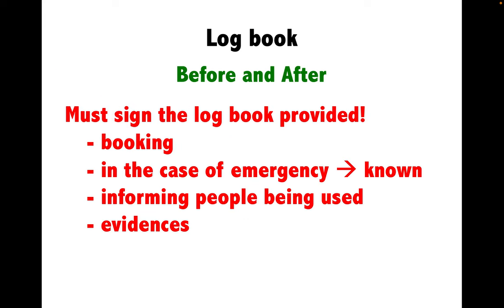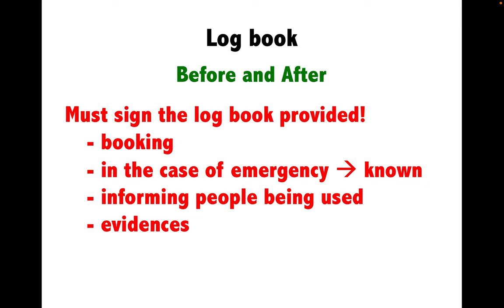A logbook is provided for nearly all instruments. It is for recording the workloads of each instrument, not for finding someone to blame. Please fill in your information before and after using each instrument. If a logbook is fully filled by users and the instrument eventually breaks, the reason is clear — it has been used heavily — and the executive staff can consider purchasing a new machine or increasing the number of instruments accordingly. The logbook also indicates who has the instrument booked, and provides good evidence for maintenance staff to consult the last user about any issues.